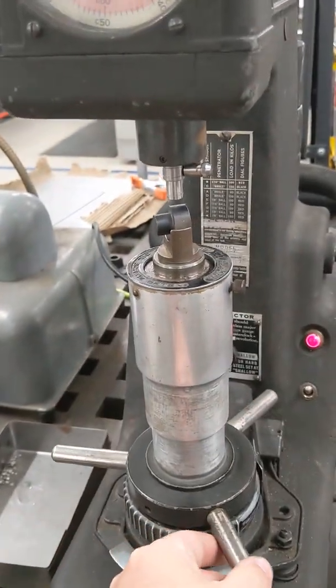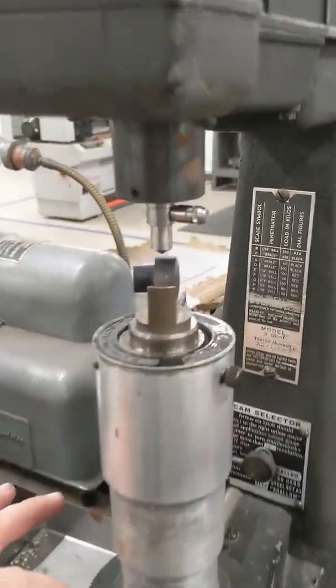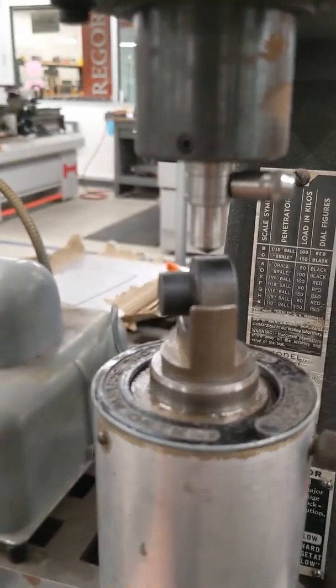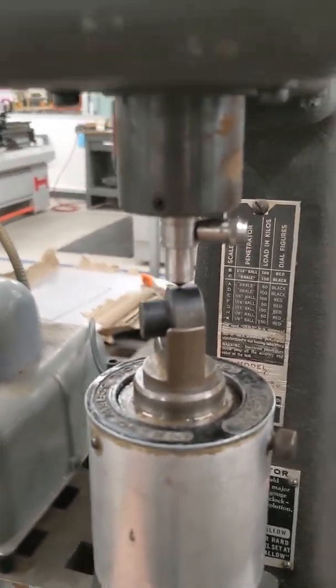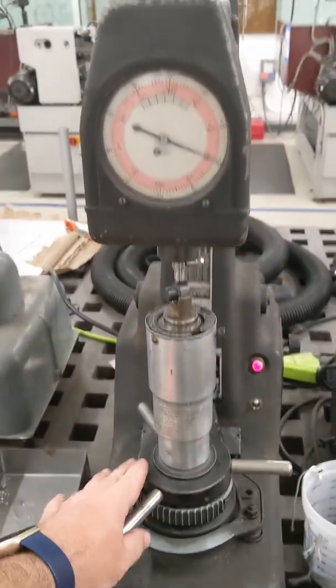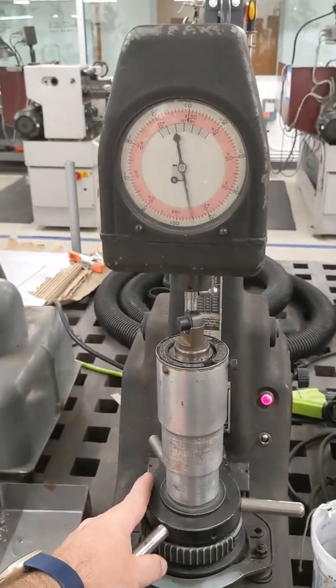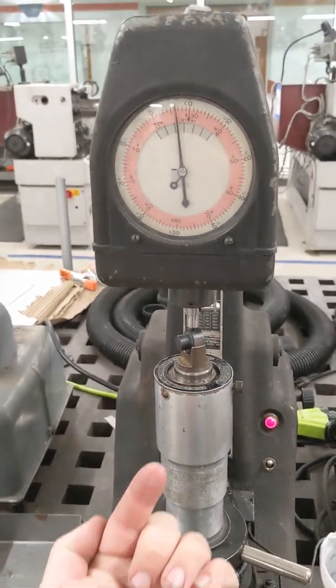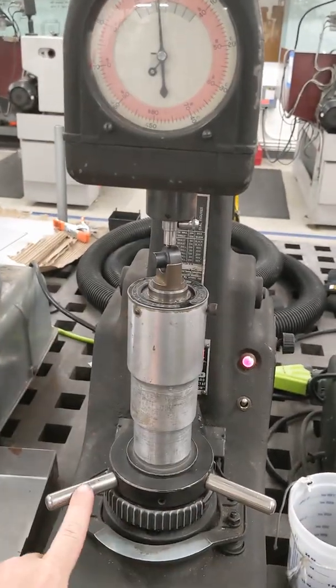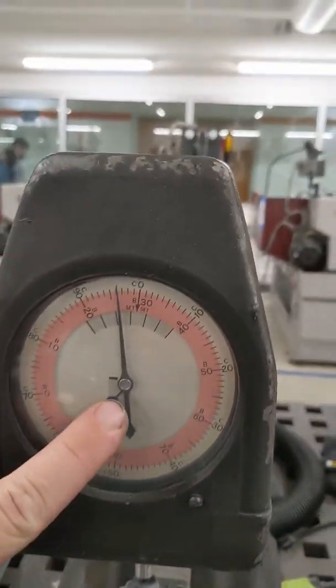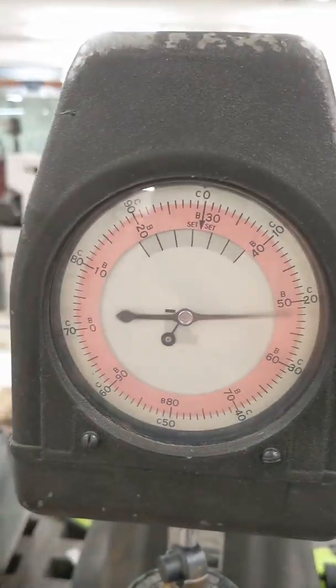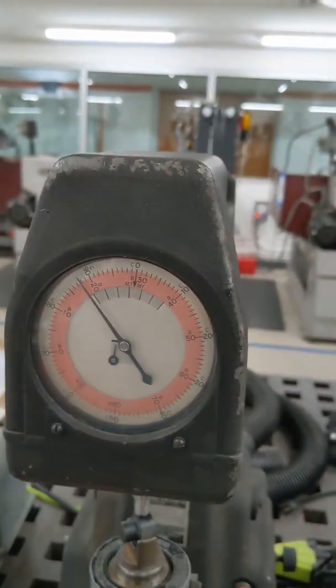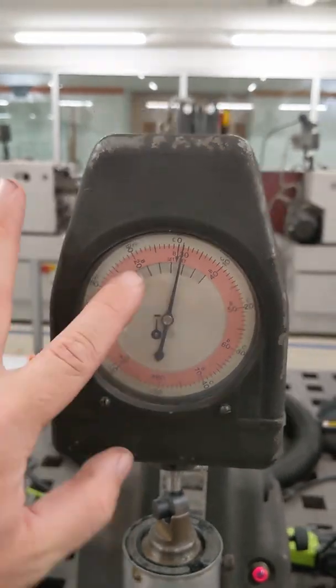You turn the handle on the bottom to bring the test sample up until it touches the indenter. Just to the point where it touches, and then you continue to rotate the handle and watch the two needles on the scale. You need to bring the sample up into the indenter using the handles until the little needle is pointing straight up and the big needle is pointing about straight up. You don't have to get it exactly at the zero.